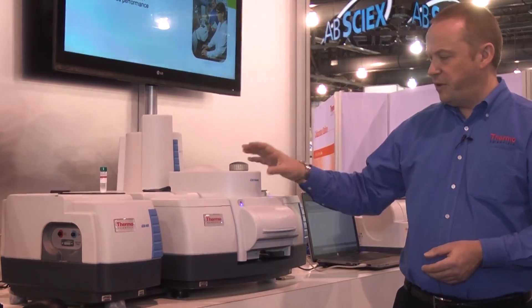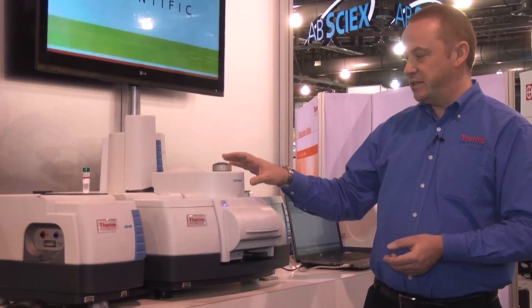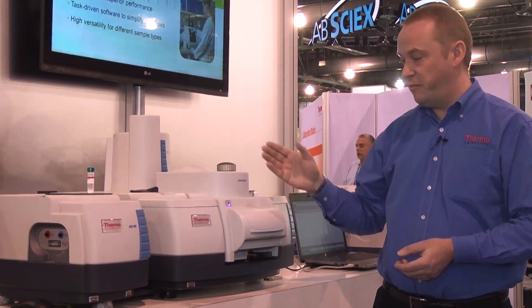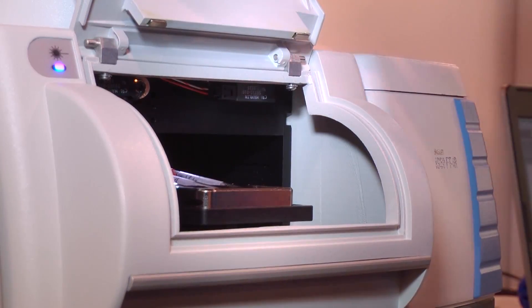Uniquely, the IS-50 can be equipped with an in-sample compartment Raman accessory. This is extremely compact, which means it has a short beam path for very good signal-to-noise performance. The sample is introduced through the front of the instrument here.